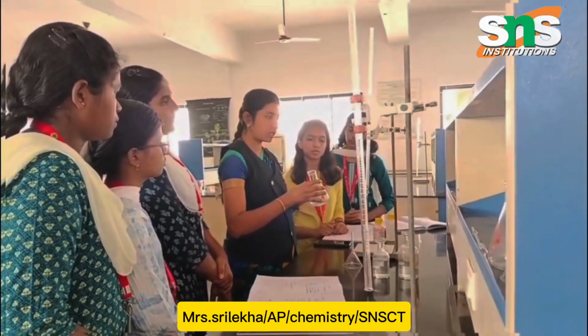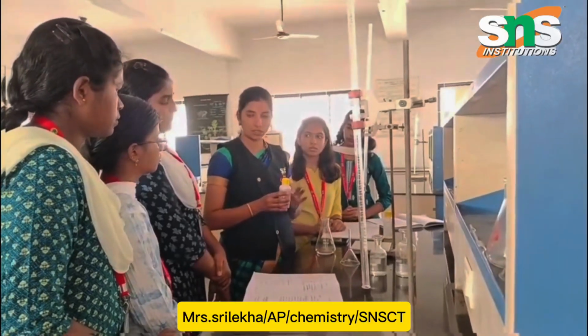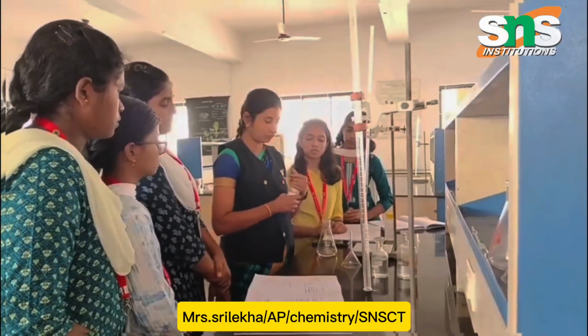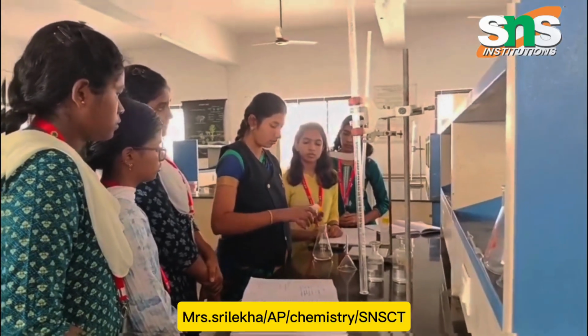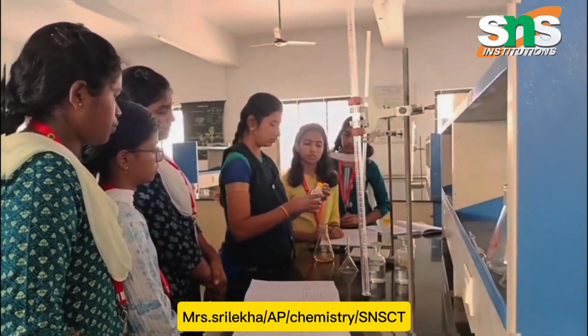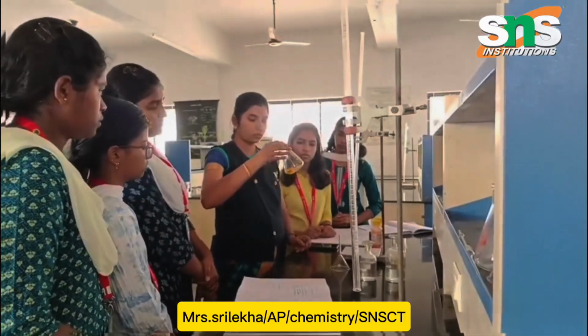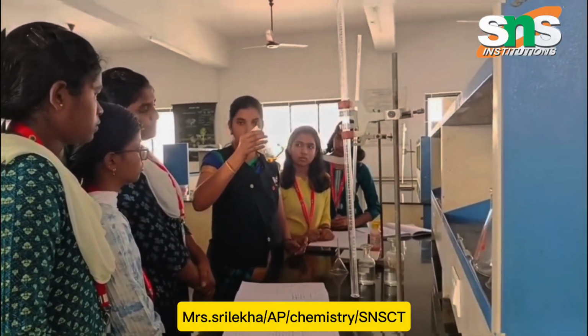Okay. Now, the same way, we add the reagent for the second titration, methyl orange. With this, the solution turns a yellowish color.